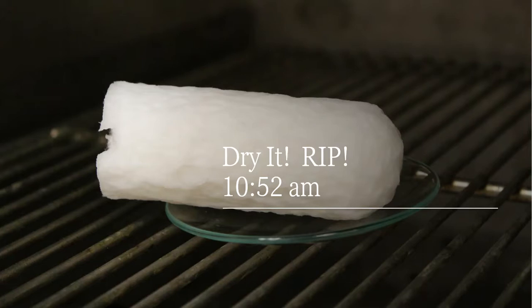All right, so here's what the thimble looks like after the extraction period. I've got a wet thimble. I have wet peanuts. I have a wet piece of cotton. So all of that needs to go into the oven, and it needs to dry. So I put it in the oven on that morning at 10:52 a.m.